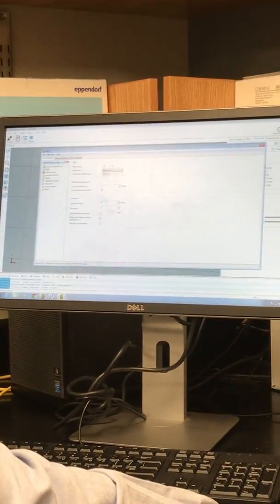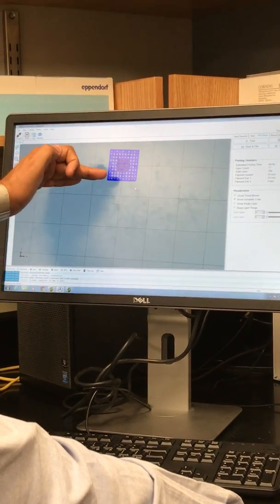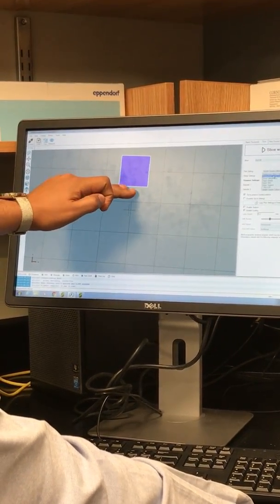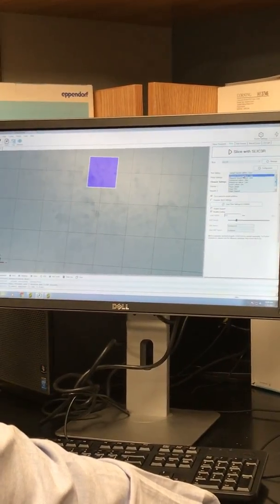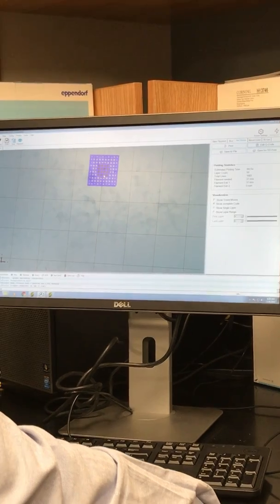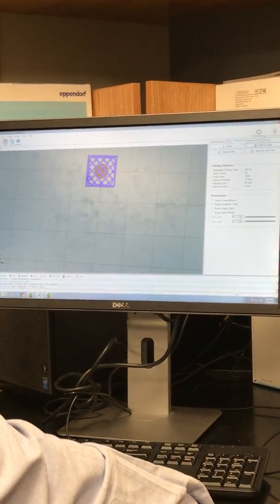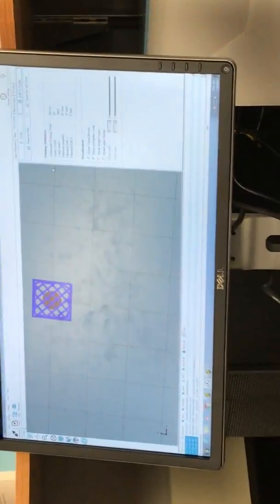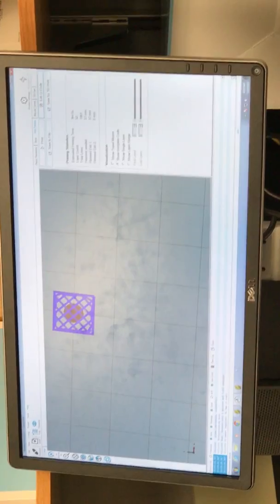What does that angle do? It's this. For example, this is a 0 angle, and if I select this diagonal, it will just change the angle of the lines. Oh, okay. So now it's a 45 degree angle. You can set that to any size. Okay. It's just that for now we just have those settings.